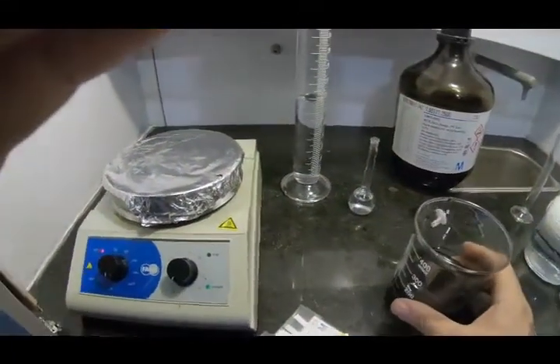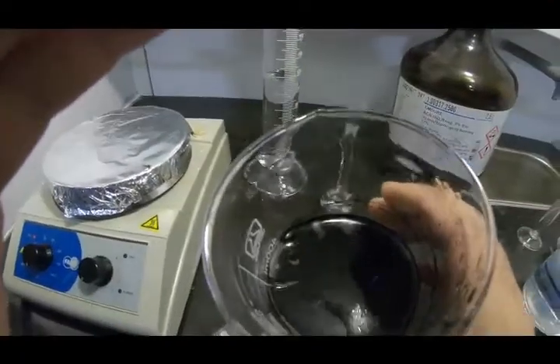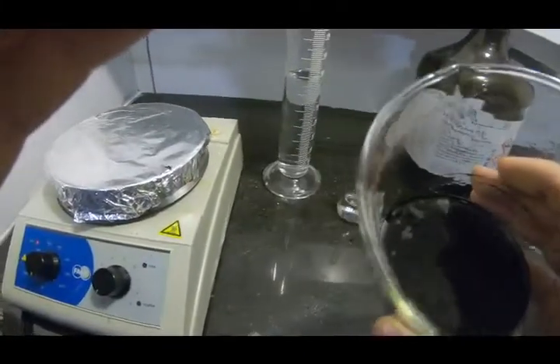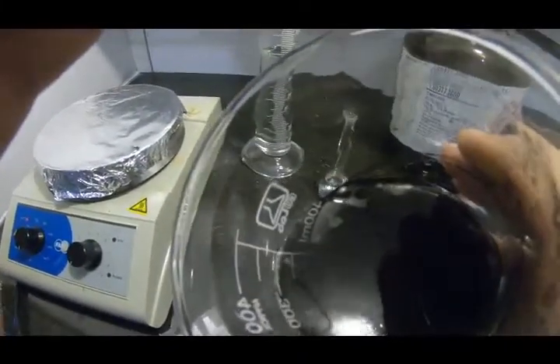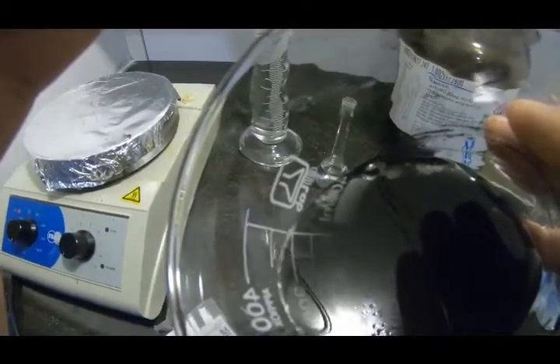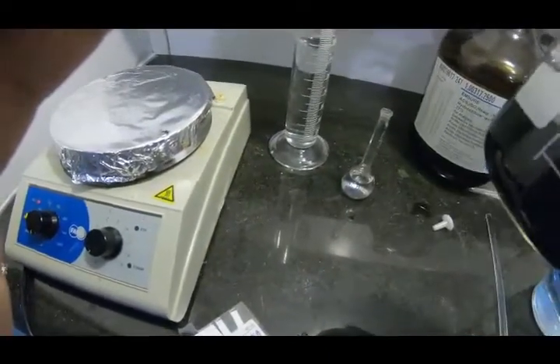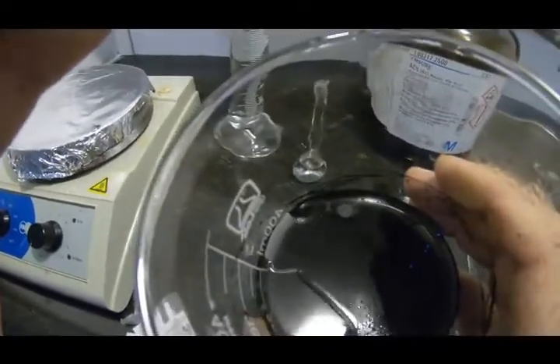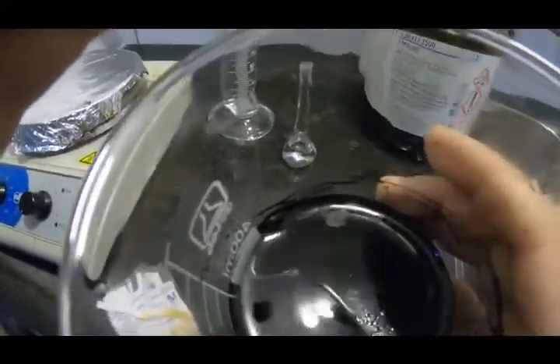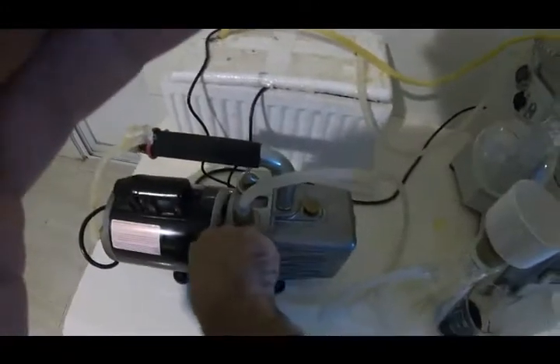Okay, I eventually got the pH right. If you look in there, it is a very clear solution on top, and the palladium and carbon is precipitated on the bottom section. So we are going to filter this and rinse it with liquid water as much as we can.